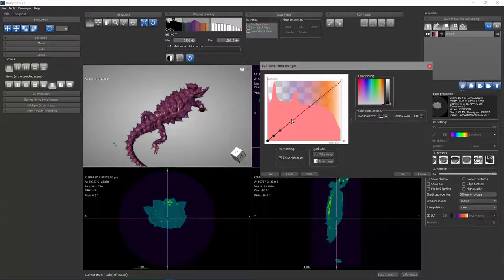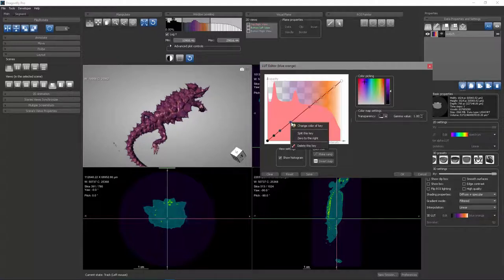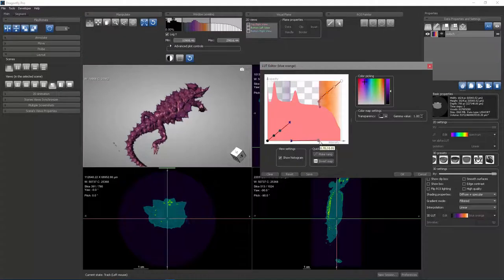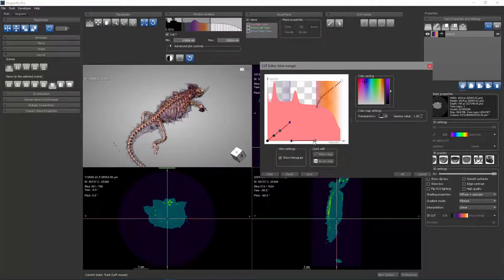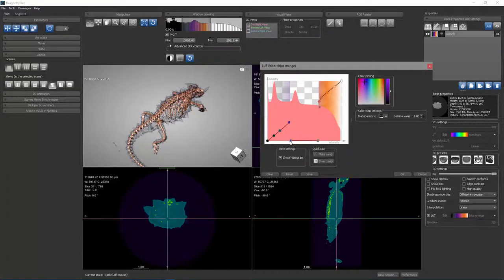We saw that you can adjust the alpha intensity by dragging this up or down. You can also take advantage of a behavior by clicking on the right mouse and choosing zero to the right. What this does is it allows you to zero out a particular band, and I can drag this over. What we've done here is we've zeroed out the band that occupies most of the soft tissue, and so it's now being rendered completely transparent.